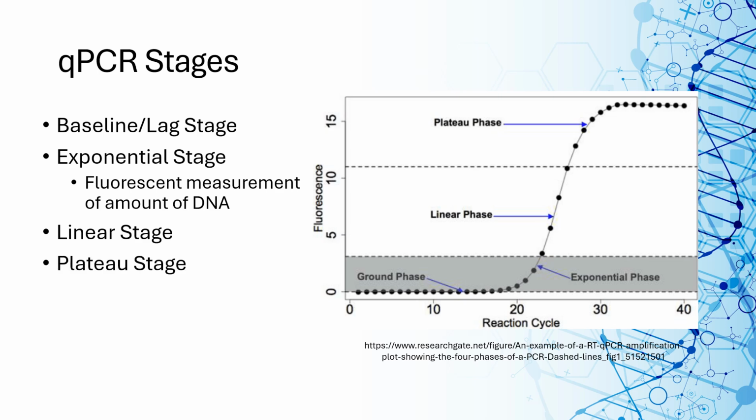Lastly, the plateau stage is when the amount of PCR products is no longer increasing due to the exhaustion of the PCR components such as primers or dNTPs.